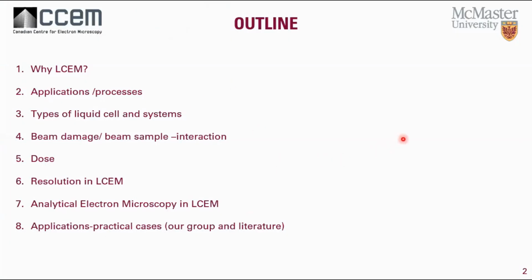So first, the outline of my talk. We're going to talk about why we should use liquid cell microscopy. Then I will talk about the applications or the processes where liquid cell microscopy can be used. I will go through the types and systems of the liquid cell.